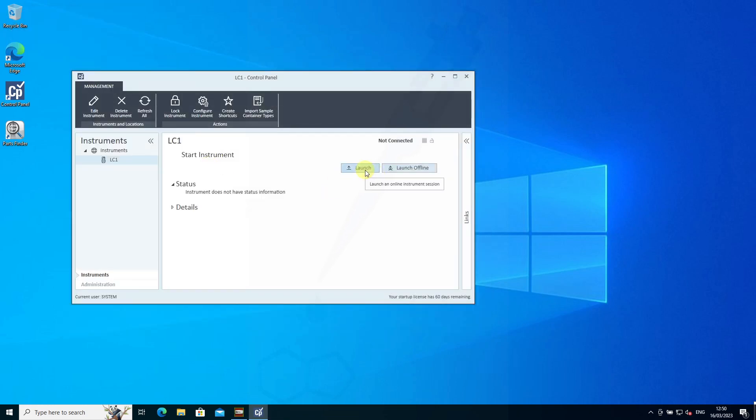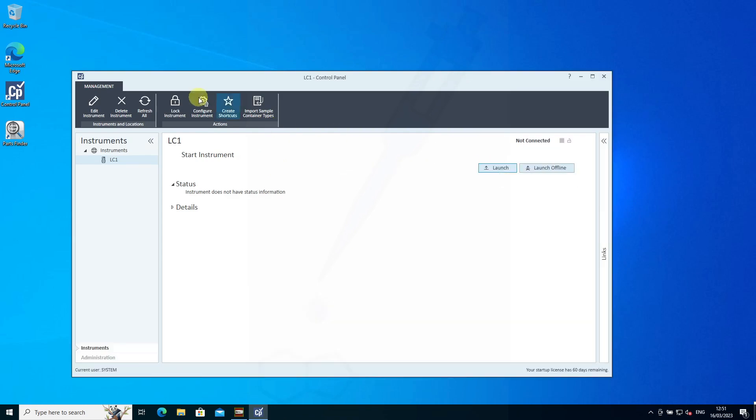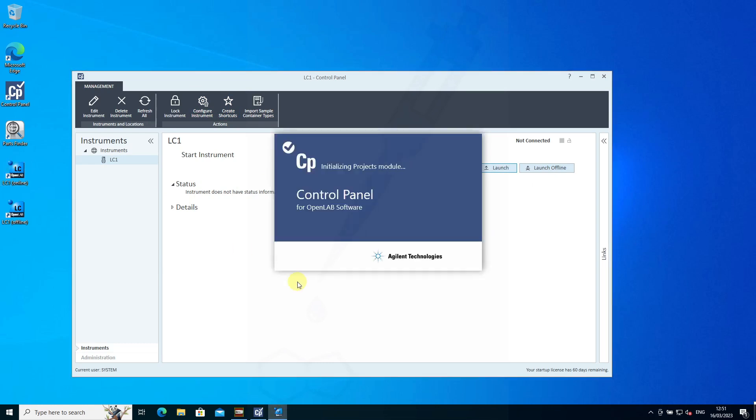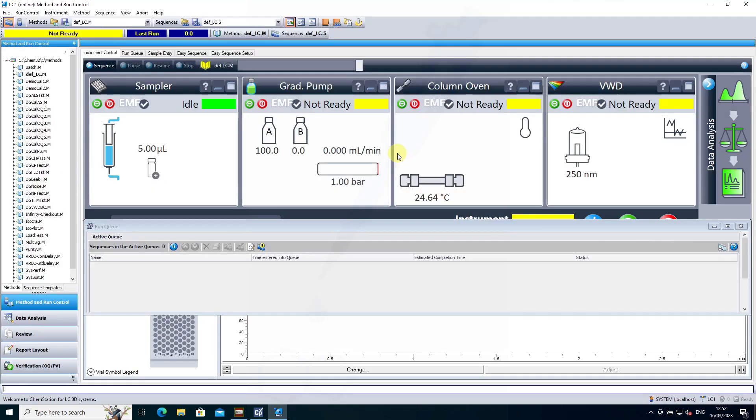We can hit the launch button from there and also create shortcuts for the desktop. This is what the interface looks like the first time you start it up, and some of these menus might have to be moved around.